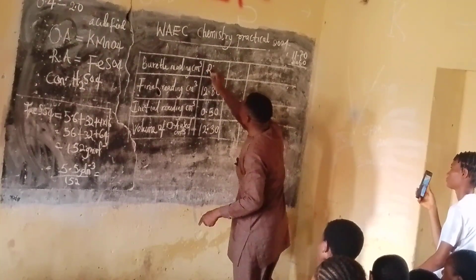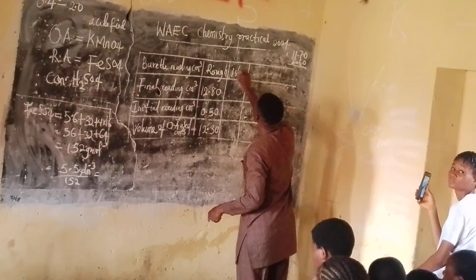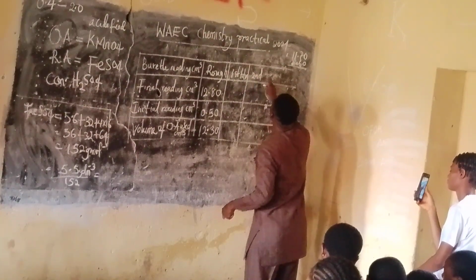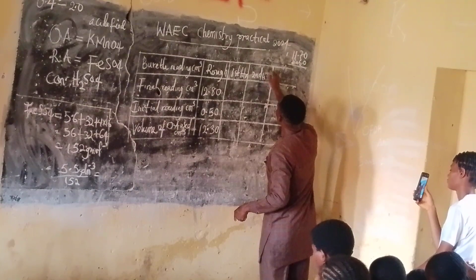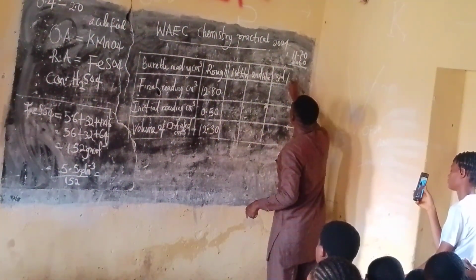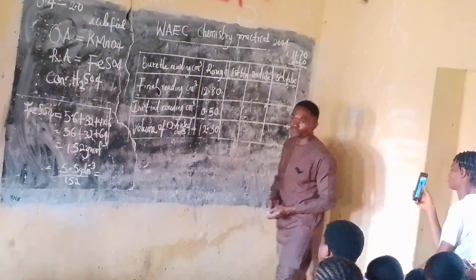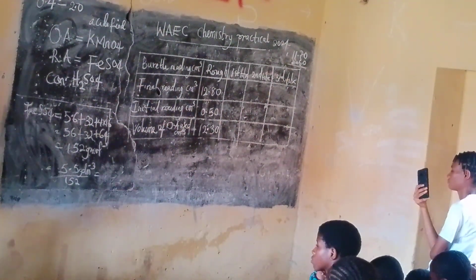This one is for rough. This is first titer. This will be second. We'll do it up to 3. Second titer. And this is what? Third titer. For a balanced work, to avoid random errors.